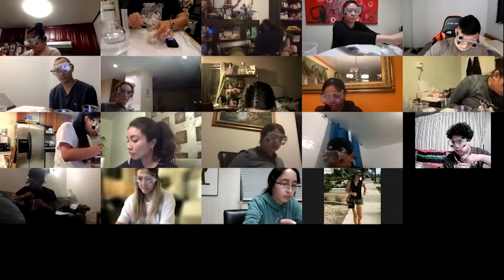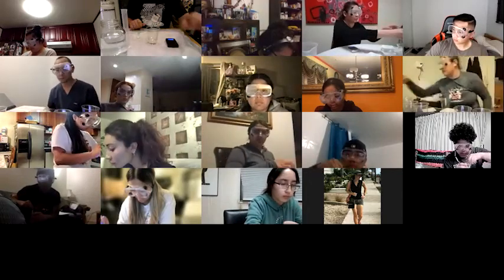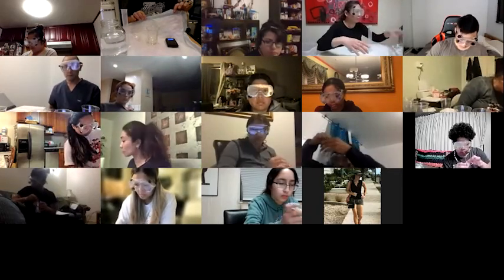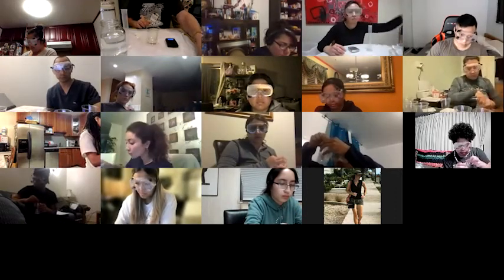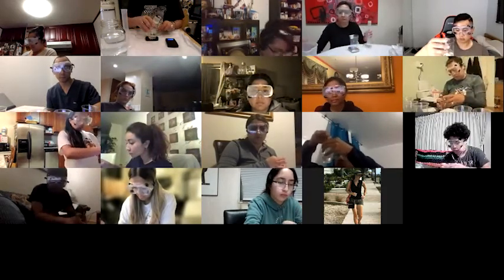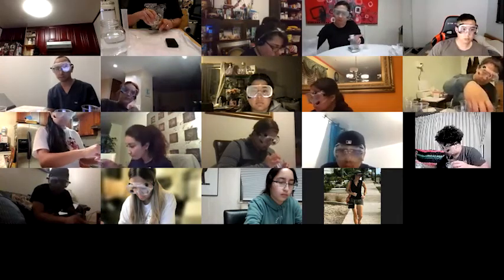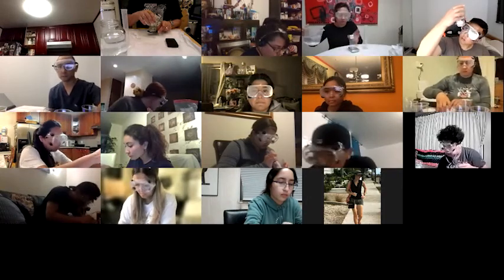Because sucrose is a white crystal, and I've got a white diaper paper here to clean up after any spills, I'm not really going to be able to see white against a white background very well. But I do have this black container, and so I will look through against the black, and I don't see anything. So I think I've pretty much got all that in solution now. Cool.